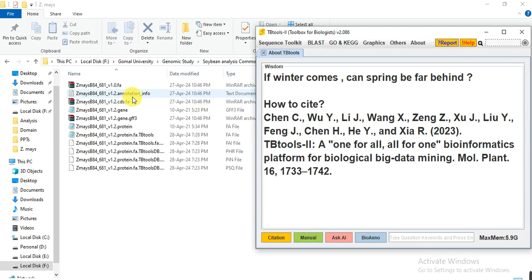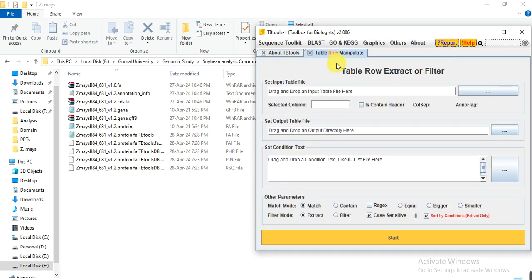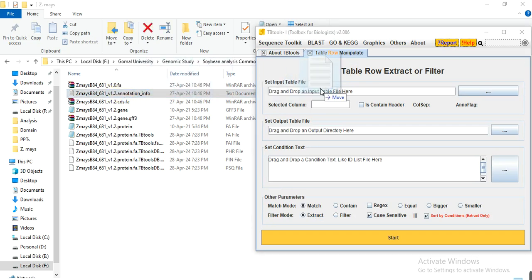We have already downloaded these annotation files from Phytosome in Part 2 of this series — you can watch that to see how to download them. Go to the tools and select the table text file manipulator, table row manipulate, then drag the annotation info file into this folder.